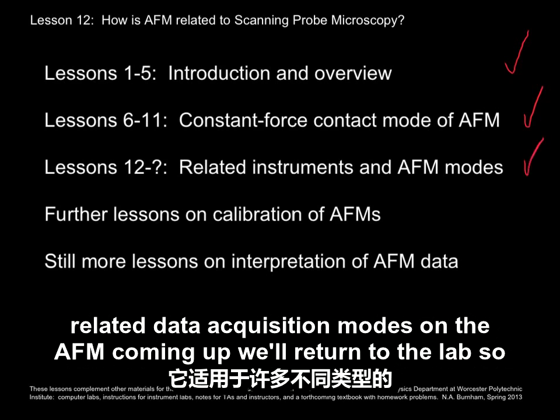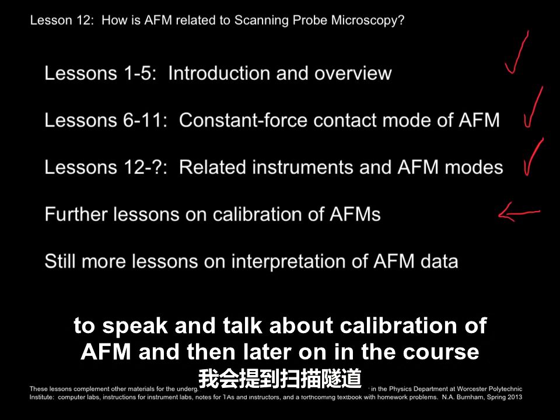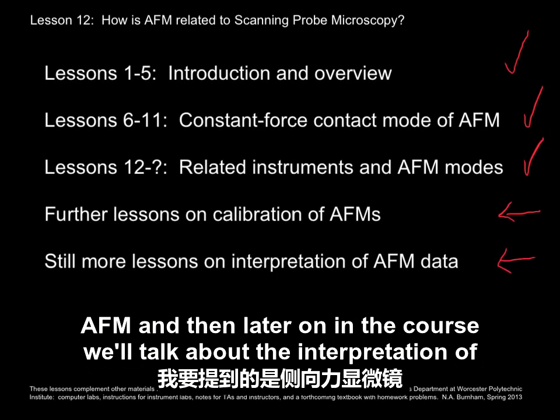Coming up, we'll return to the lab, so to speak, and talk about calibration of AFM. And then later on in the course, we'll talk about the interpretation of the data.